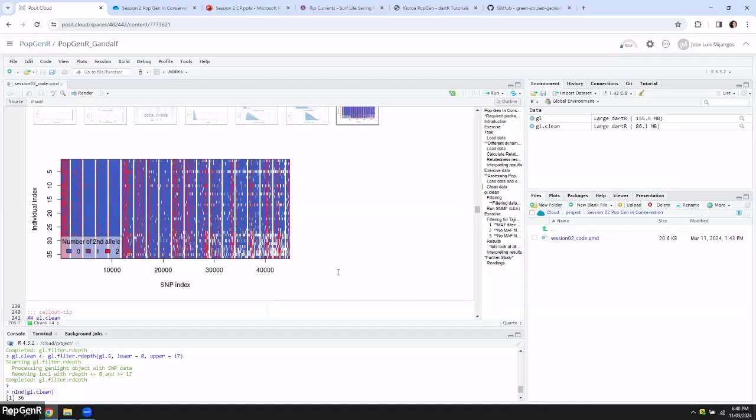And this is cleaned up. This is not at all what I would use to run an analysis, but I've just got rid of everything that's kind of a mess. So I'm left with something where I feel confident that I can properly understand the filtering parameters.